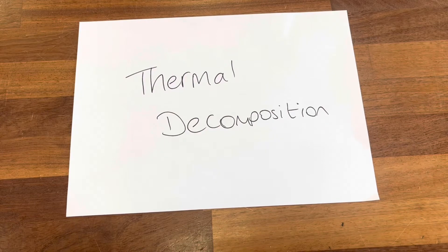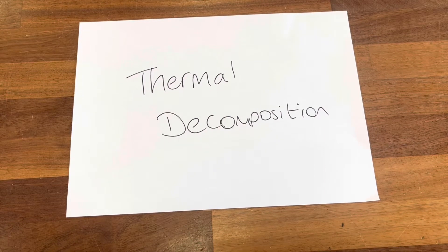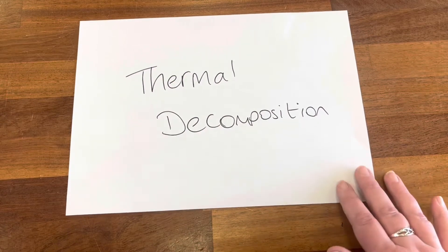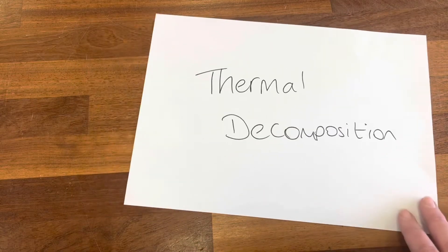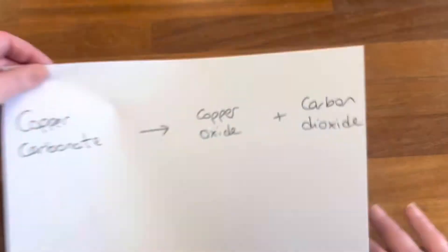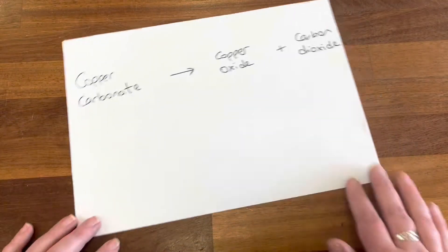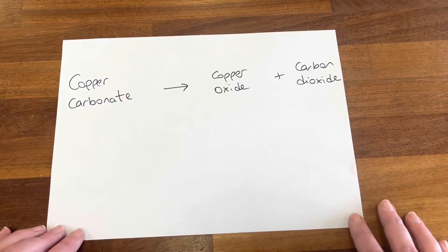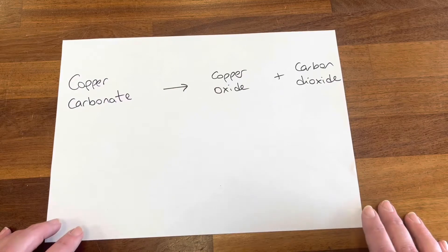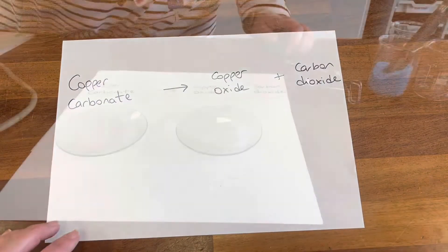I've got two examples for you. Our first example is copper carbonate. We're going to heat copper carbonate and it will decompose to form copper oxide plus carbon dioxide.